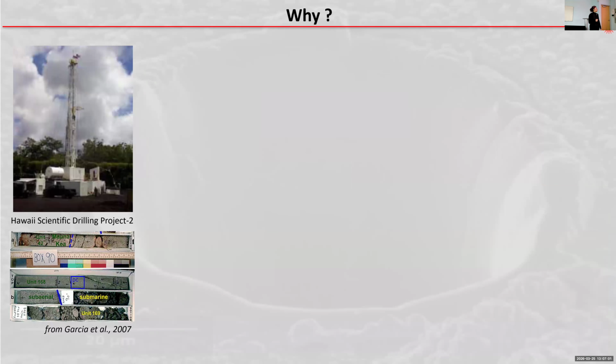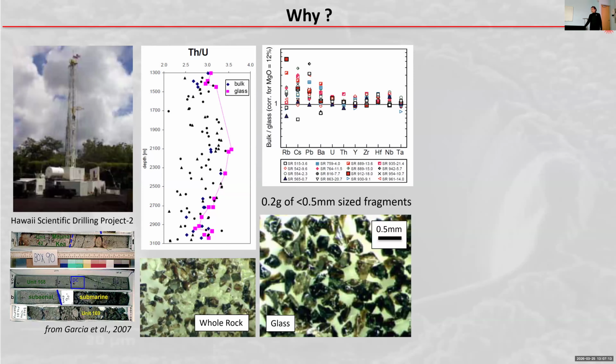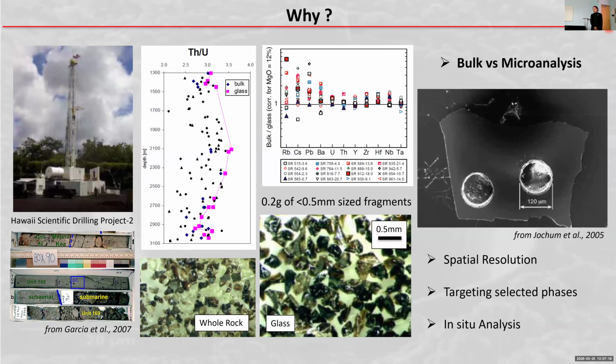Or, if you had suffered through a good portion of your thesis, just like me, picking little glass fragments out of a whole rock powder just so you can discriminate between the two phases, only to learn afterwards that your lab will acquire a laser ICP-MS instrument, just after you finished, and that you could have done it with just one glass fragment, then you'll learn, like me, a really bittersweet but really great appreciation for this technique.